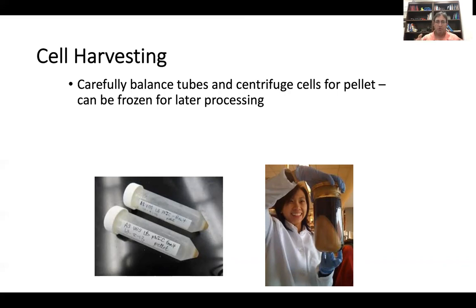Don't guess. If you use a conical tube in a round rotor, you're going to distort the conical tube, it'll break, and then you get an imbalance. And this is not your mom's or dad's washing machine where it just gets out of balance and stops. You can actually break the rotor, break the spindle, cause tens of thousands of dollars of damage and maybe even personal harm. This can be done in even liter or 2 liter volumes.